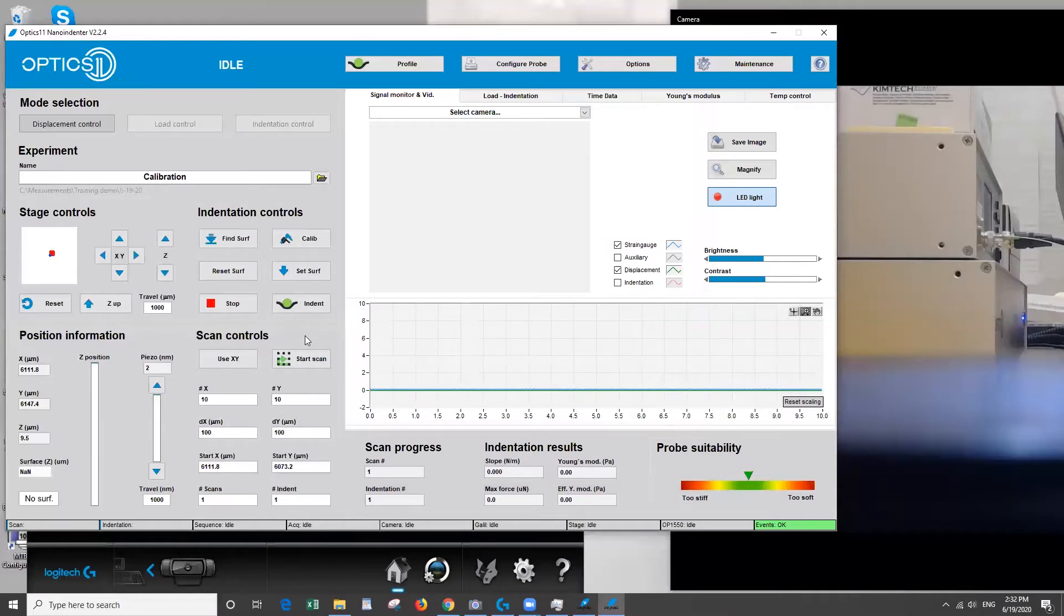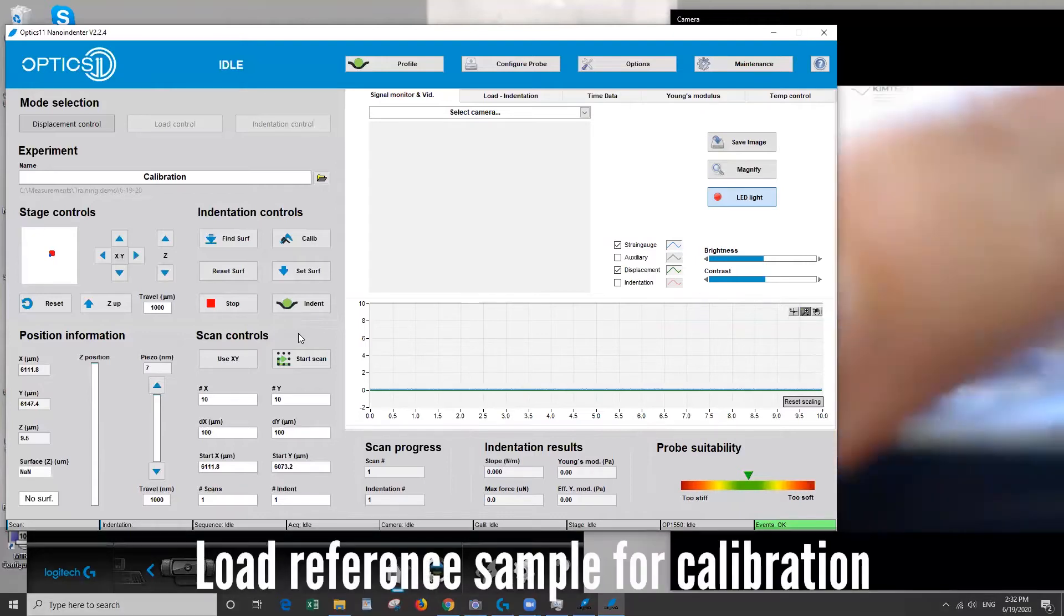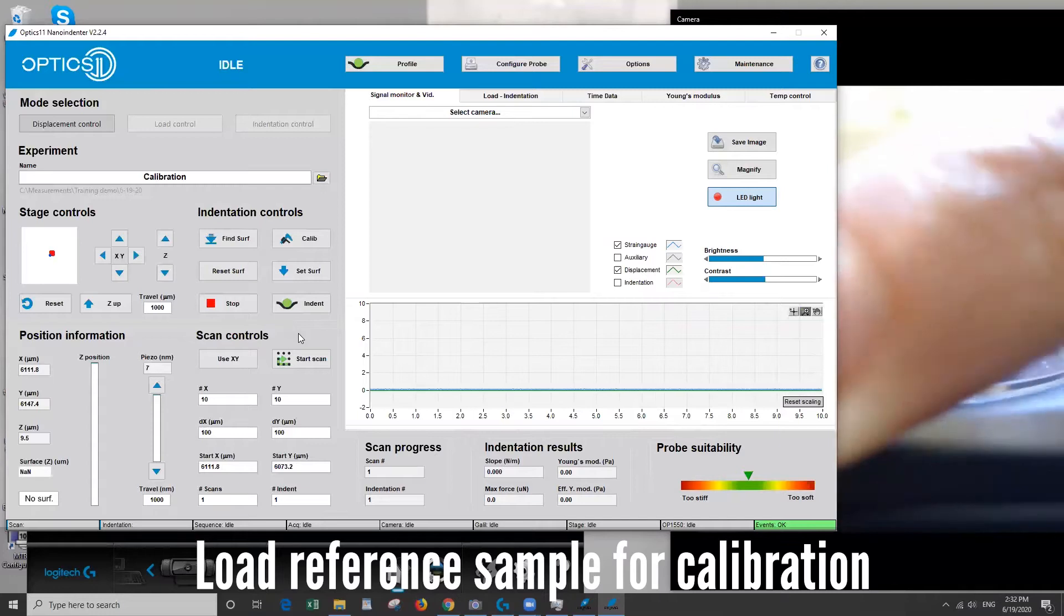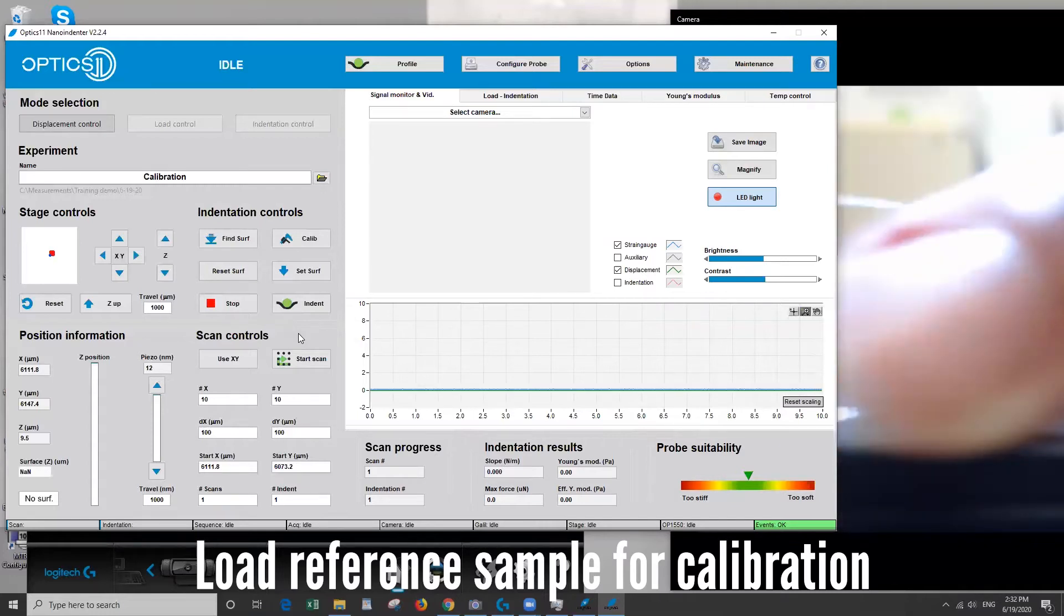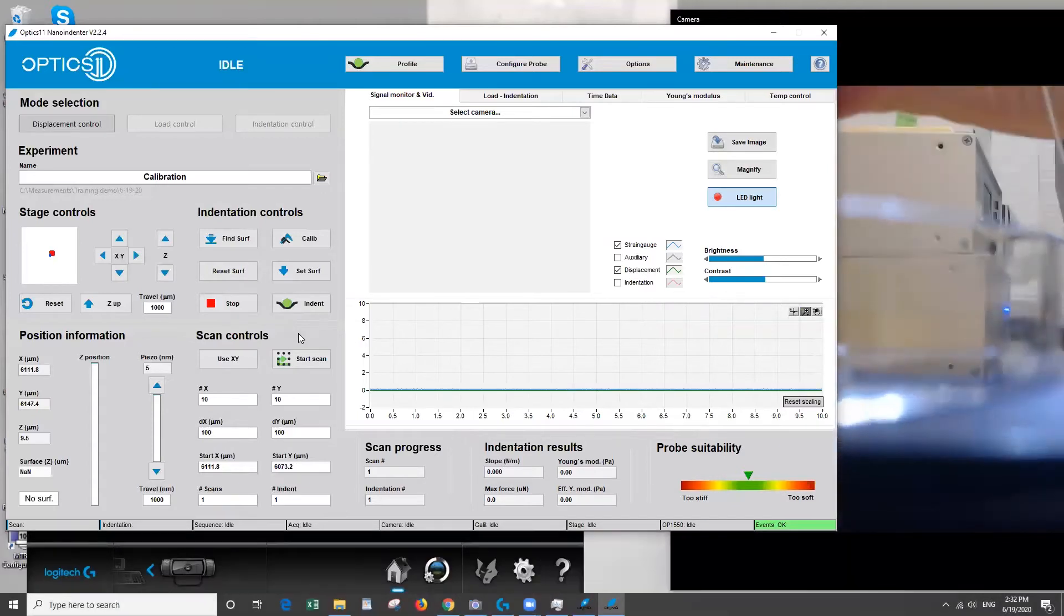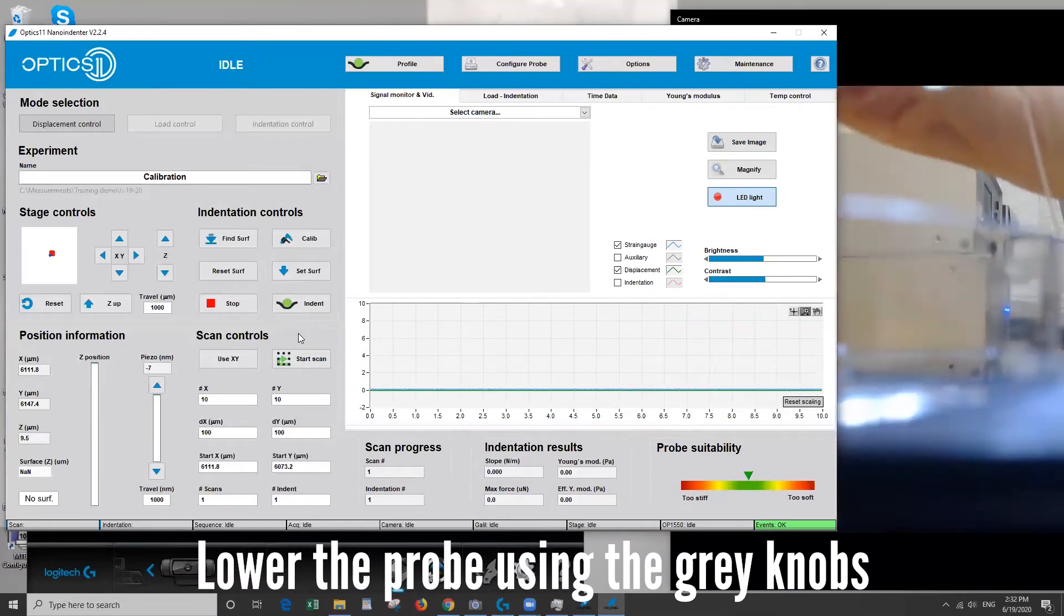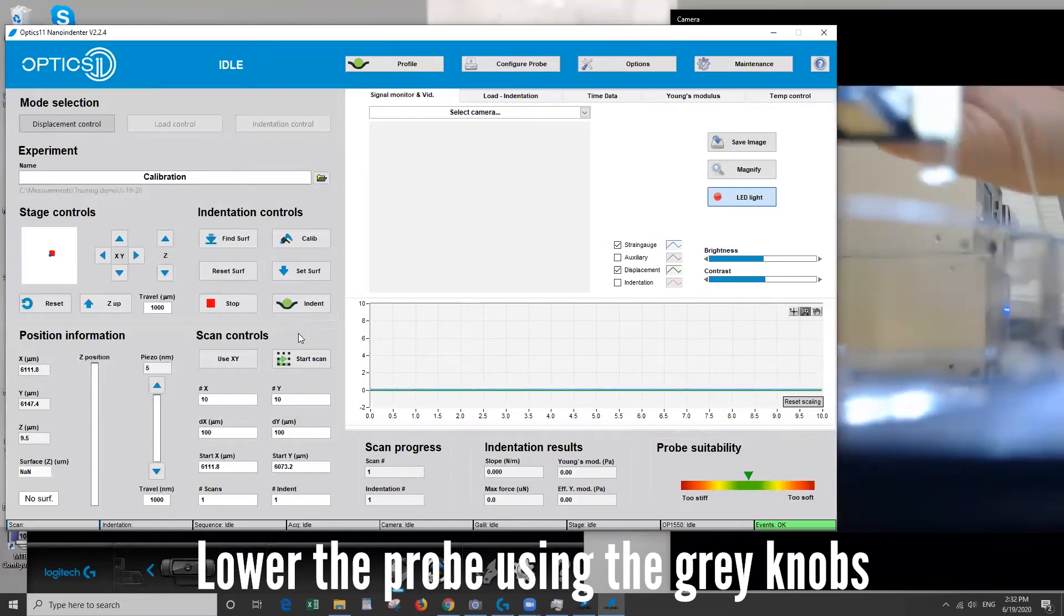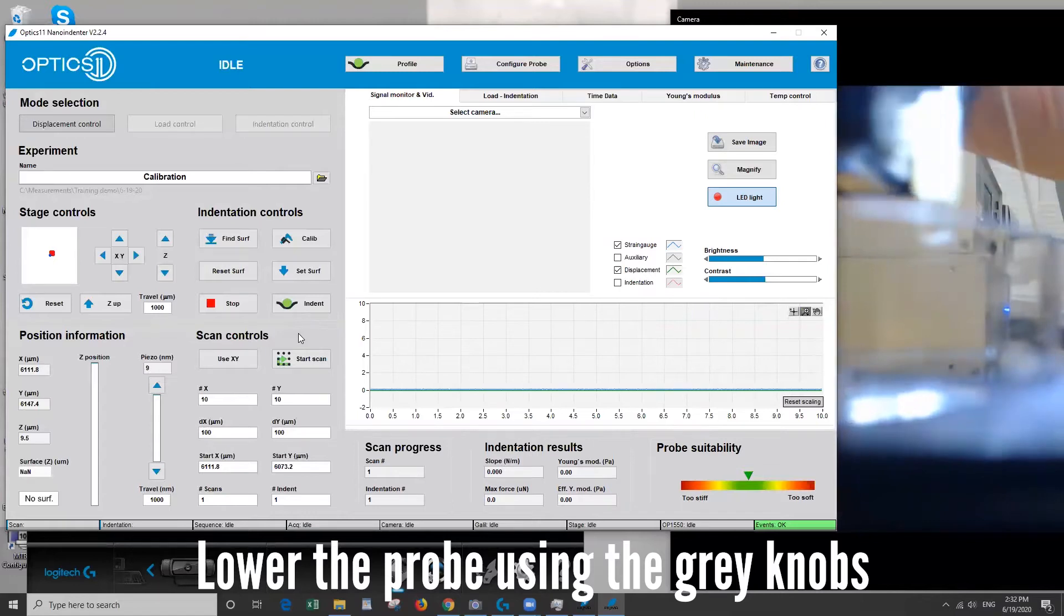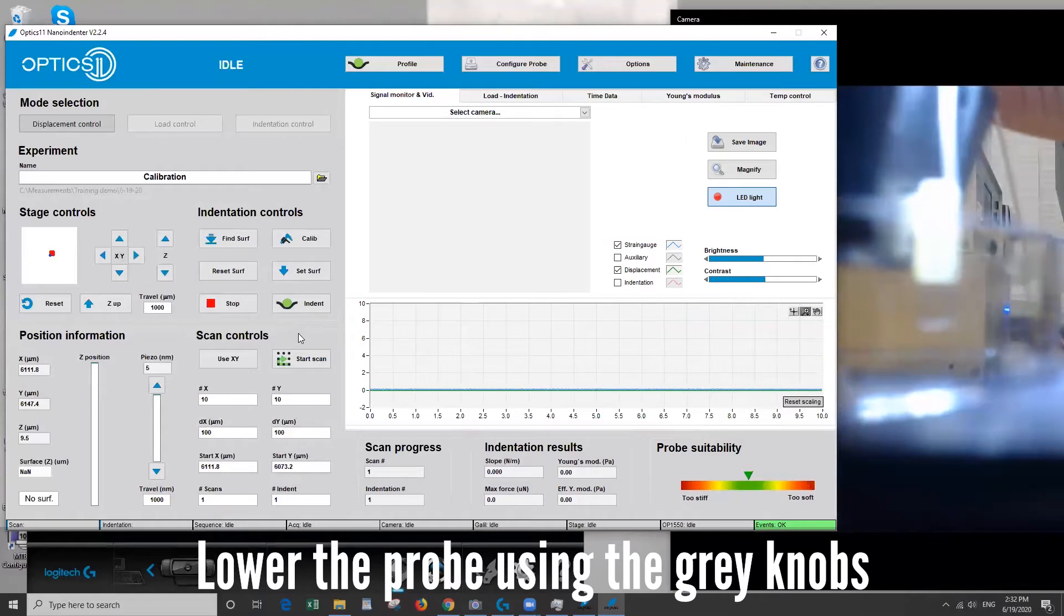Okay so to get ready to do a calibration first we're going to use a silicon sample. So I'm going to place that on the stage below the tip. Then I'm going to lower the gray knobs to bring the tip close to the surface.